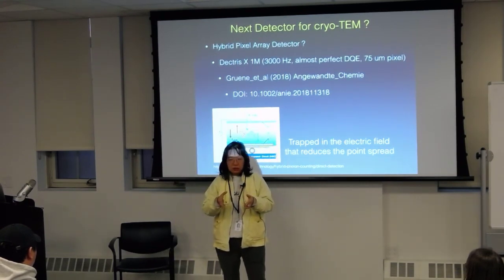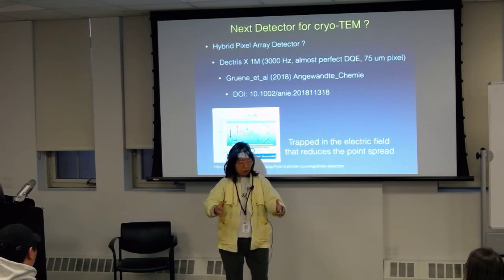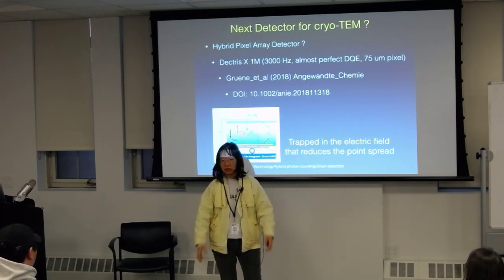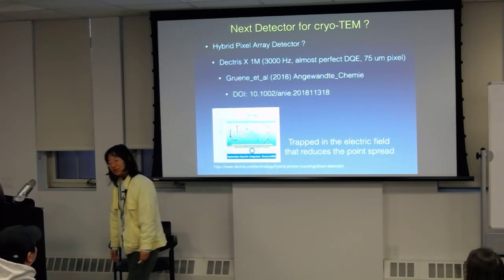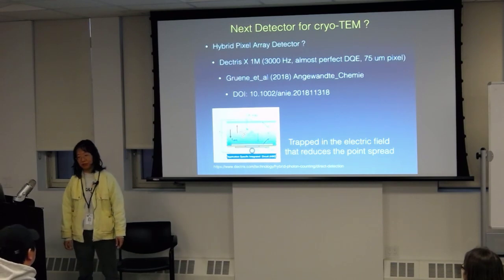Now, for us, it's a problem because the larger your detector is, the bigger the area you need to pump down in a vacuum. That makes it hard. So it hasn't been happening yet for us to be able to use this. But it might change, and that will be the next round of, I guess, a jump, possibly.